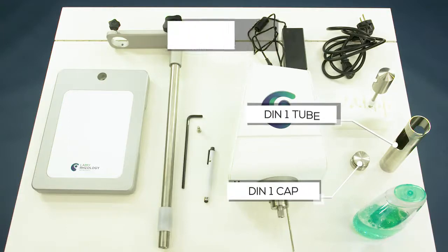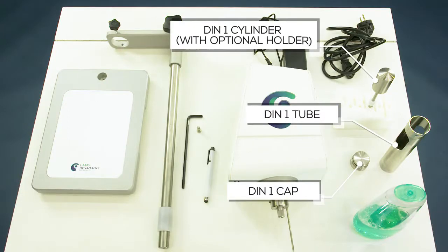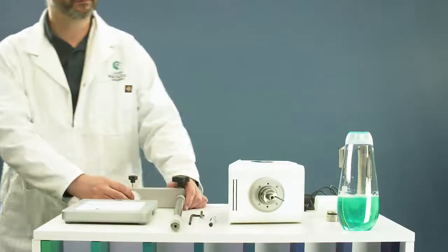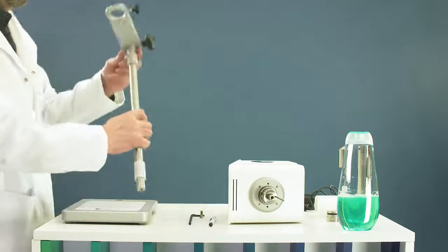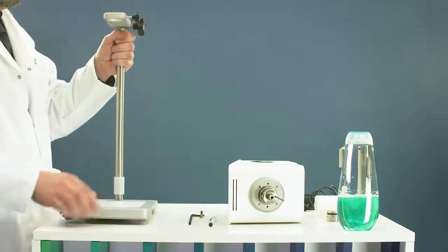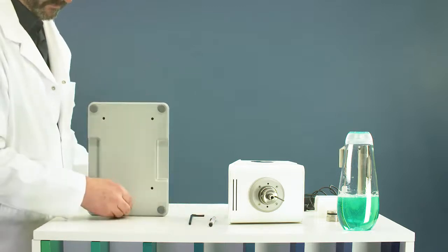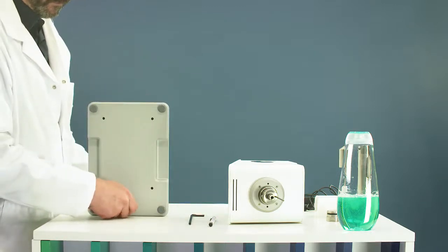Unpack all accessories from the box according to your configuration. Mount the stand to install the viscometer. Present the rod with the arm on the lower plate and fix the rod with the provided screw.